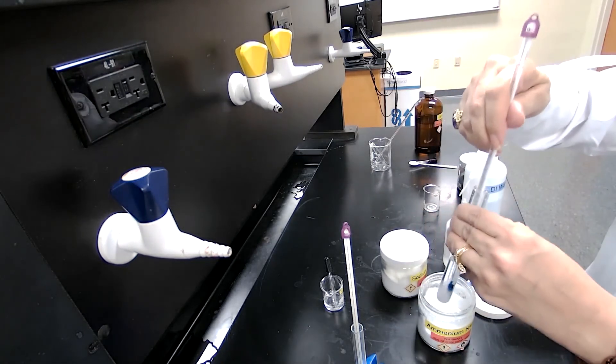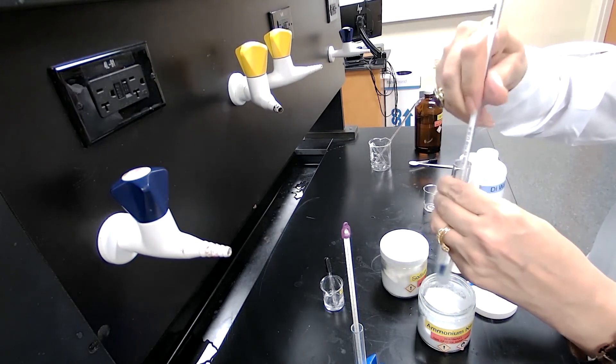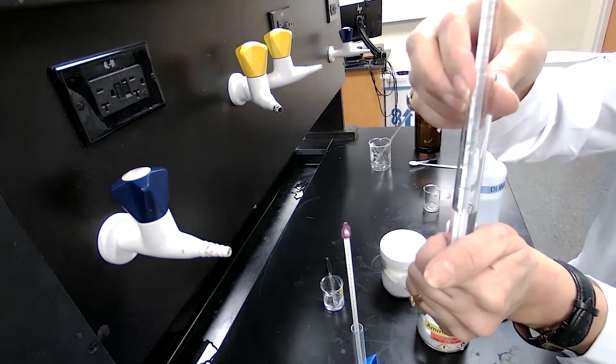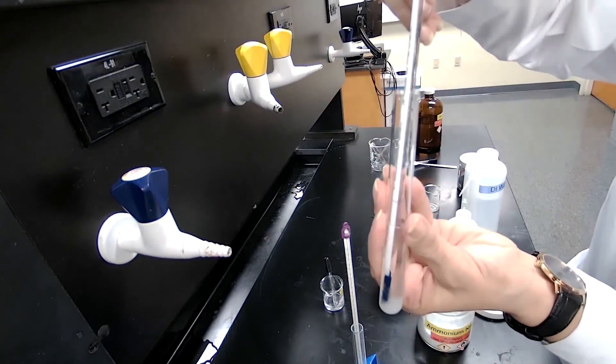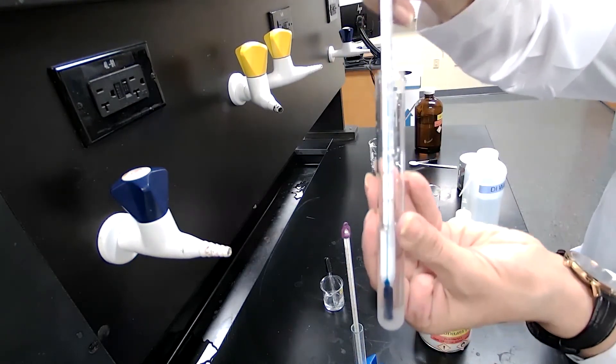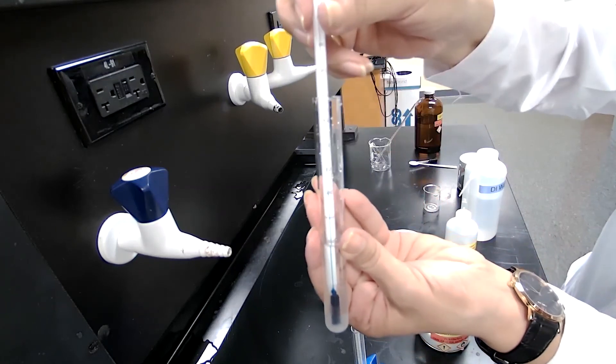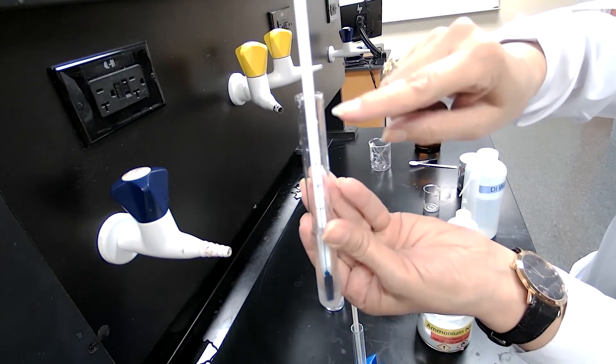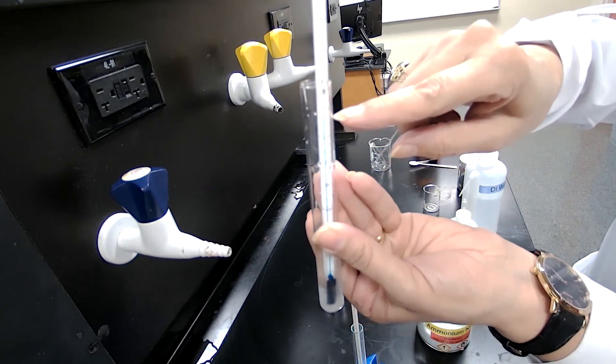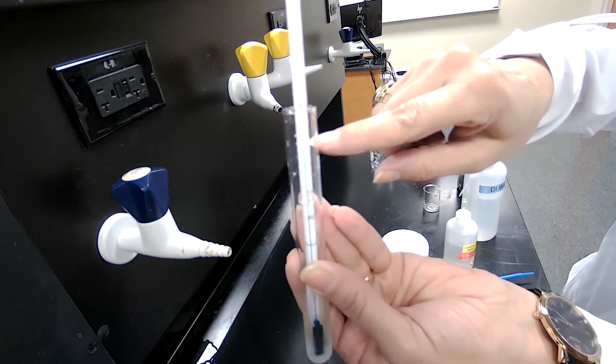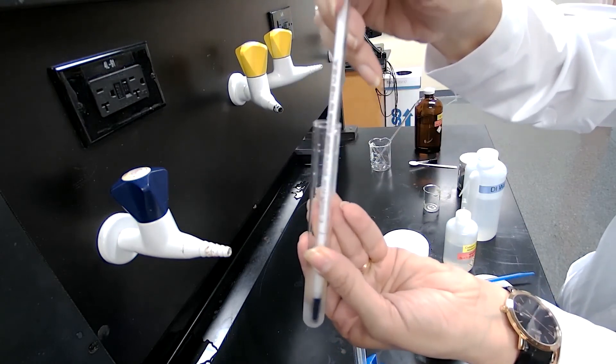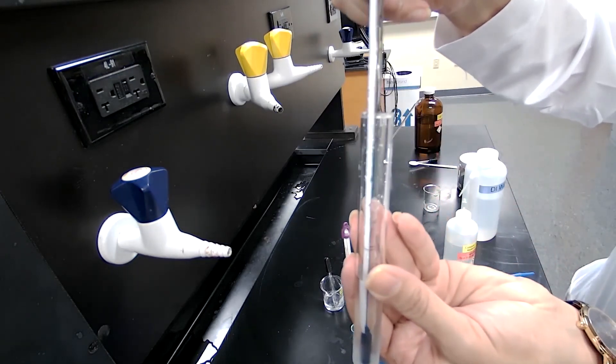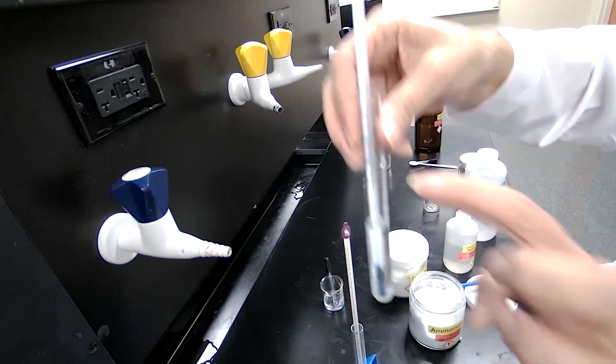The level of the thermometer now was at 22, all the way up here, and now it's down here. For the ammonium nitrate, the temperature went down to 9. For ammonium nitrate, the temperature went down to 9.